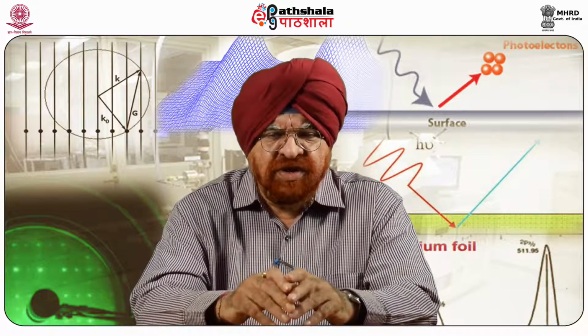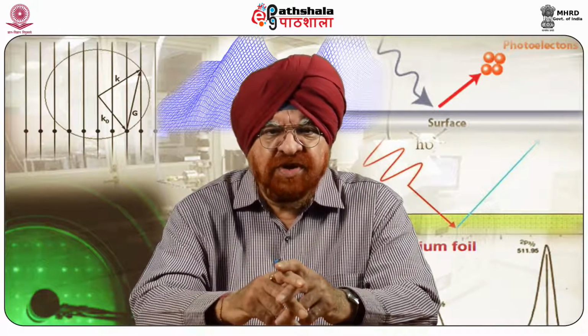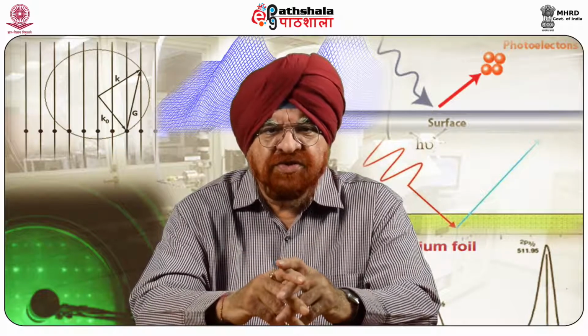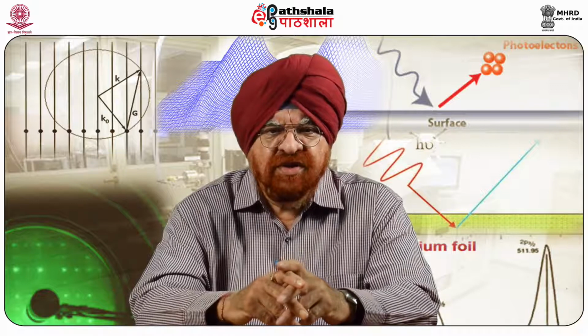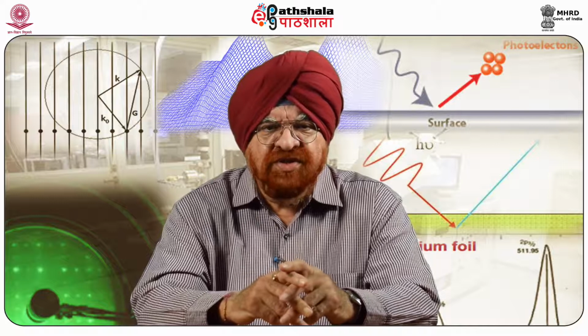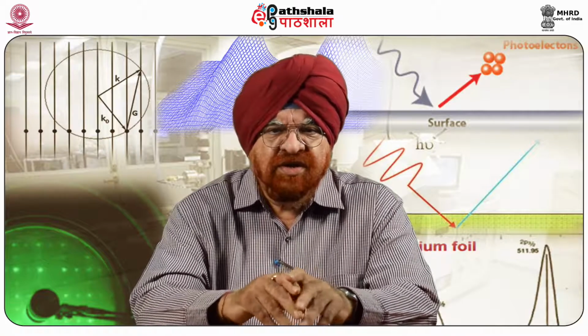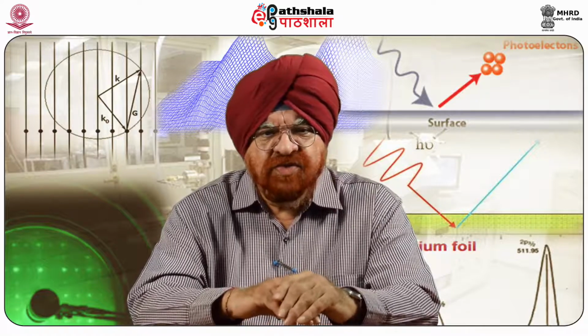Out of the above techniques which I have enlisted, MFM has been extensively used in the past 2 decades for depiction of magnetic microstructures at the surface of ferromagnetic substances at micro or nanoscale.